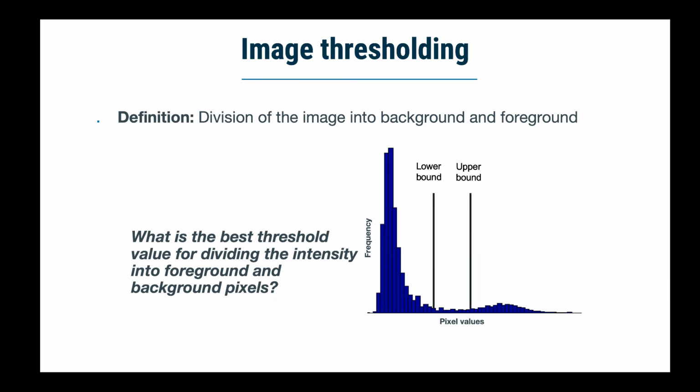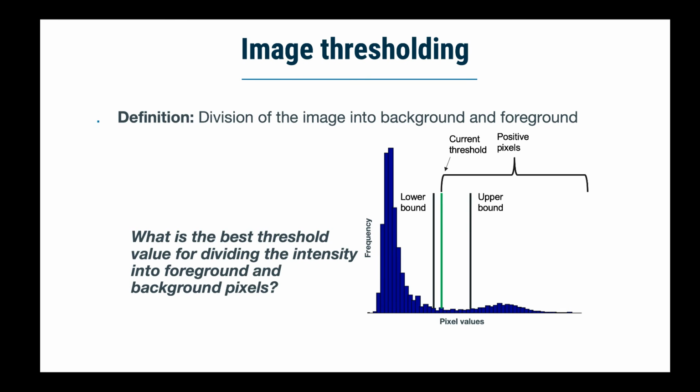On this histogram, for example, we know that the threshold for determining signal from not signal is probably not here. It's probably not over here. It's probably somewhere in this. And so if we look at all of our images are very consistent, and we have a reasonable set of data that we know supports this, we can decide to only let thresholds fall in that region.